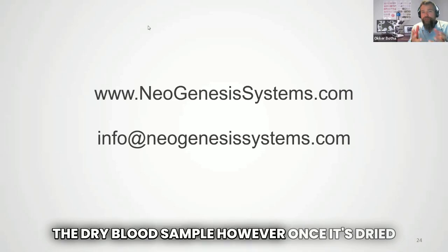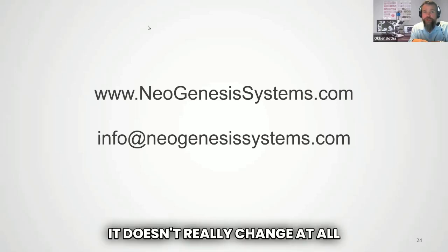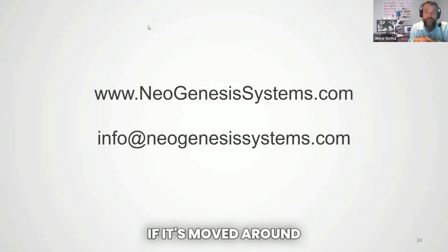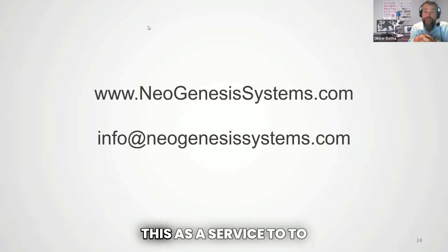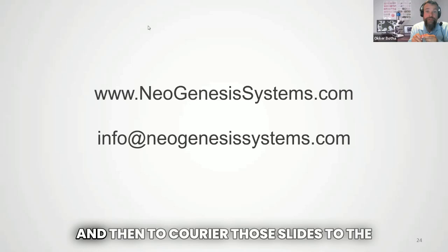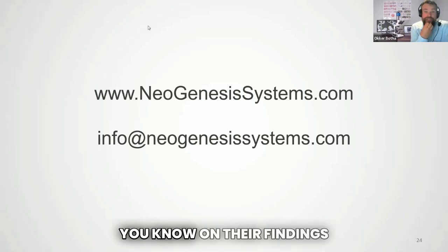The dry blood sample, however, once the blood is dried on the slide, it doesn't really change at all, and that can be shipped. Once it's dried, it's also set, so it's not as sensitive as the live sample. Nothing really gets damaged if it's moved around. So we do have some groups that offer this as a service to their clients: to have them take their own dry blood samples, and then courier those slides to the practitioners, and those clients then get a report on their findings.